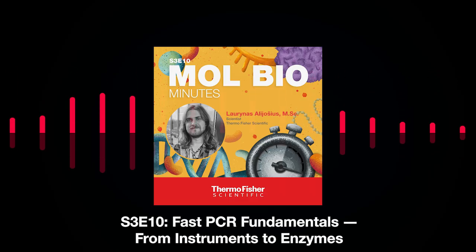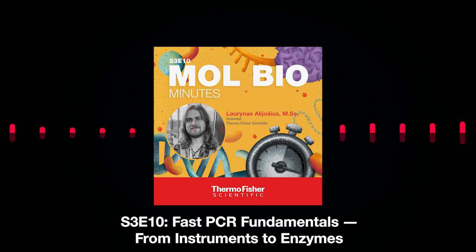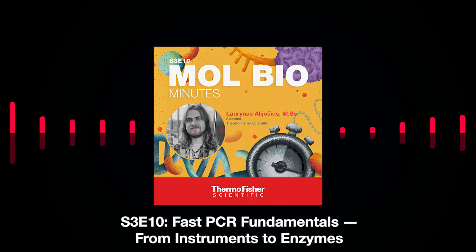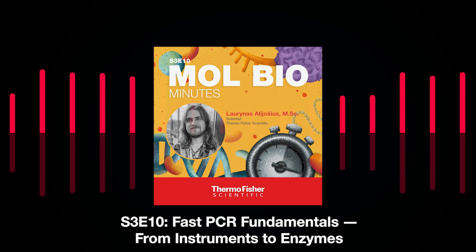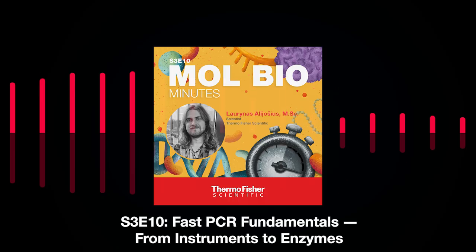Okay, so we talked about the setup of your PCR reaction, but what about the cycling program for the fast PCR? First, you can lower the number of your PCR cycles in general, although that correlates with the amount of the starting DNA template. I think a good starting amount of PCR cycles would be something like 30 cycles. That's a good starting point to work from.